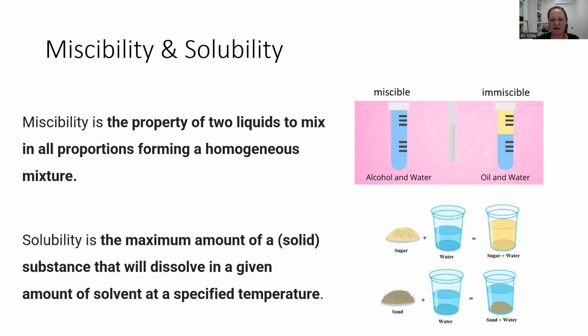So for some solids, for example sugar, if you mix some sugar in water, the sugar will dissolve to form what is known as a solution of sugar water.